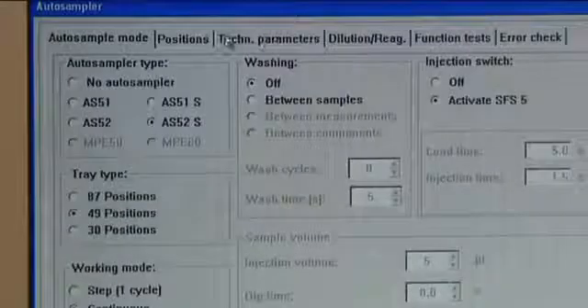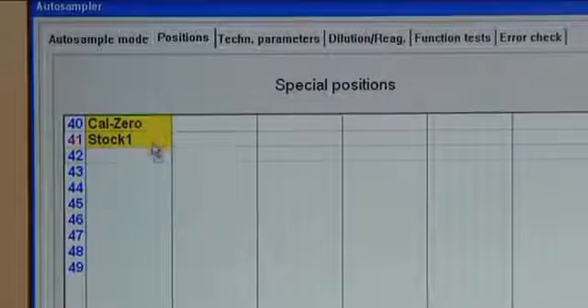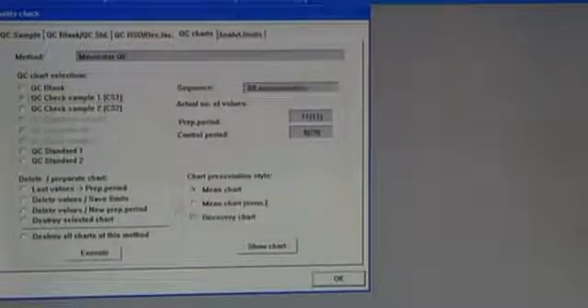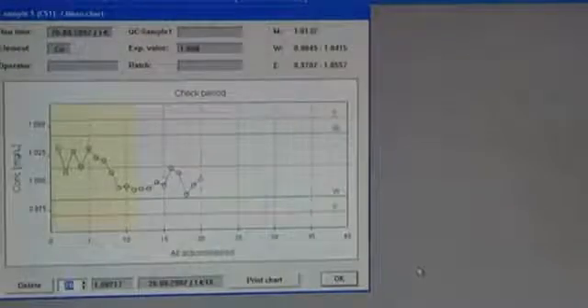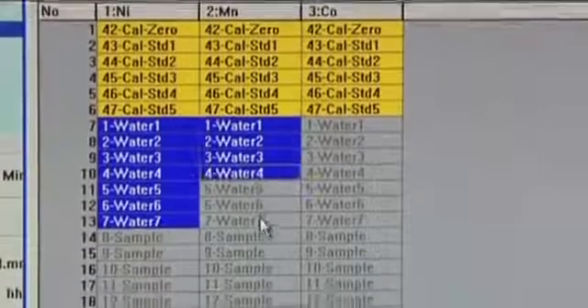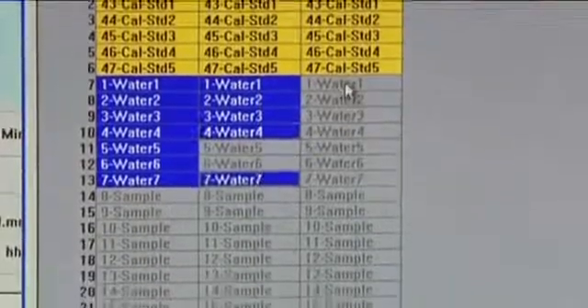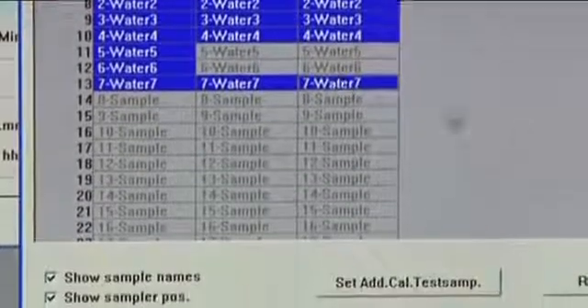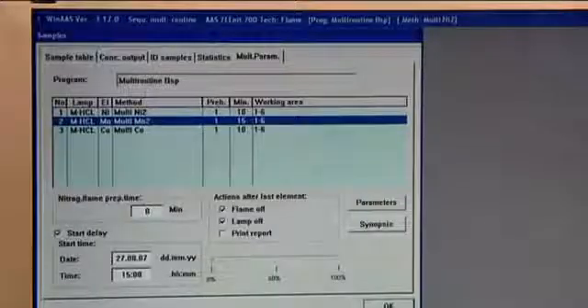Within the self-check system, numerous quality assurance functions with a flexible sample logic monitor the state of the instrument and the correctness of the values measured. Individual element methods for a sequential multi-element routine can be combined for determining several elements in one series of samples, with the desired elements processed fully automatically one after the other. Since the next lamp is already preheated, there is no waiting time when changing from one element to the next.